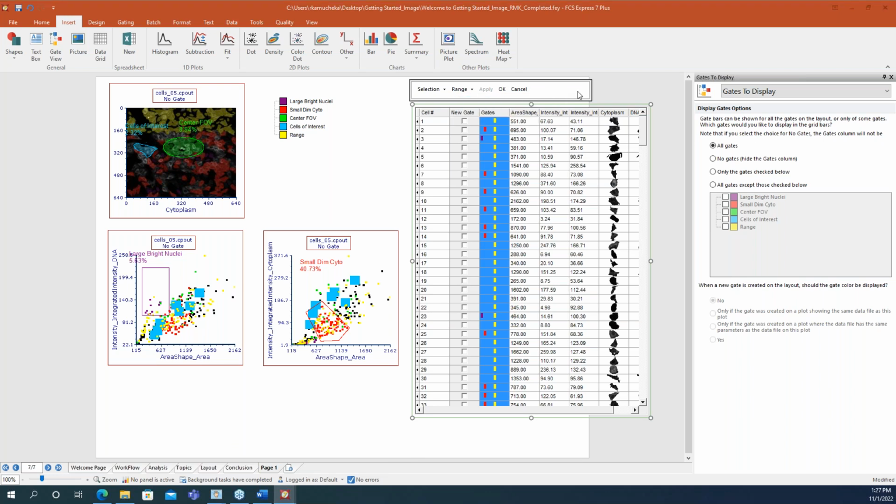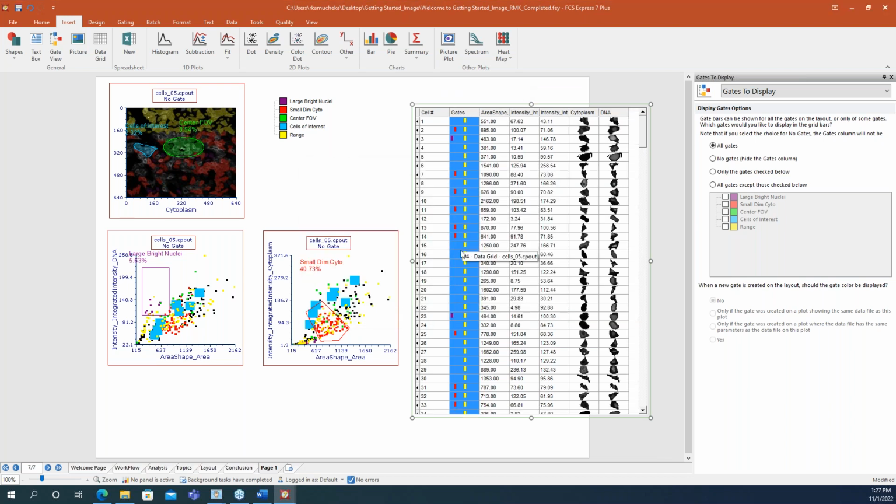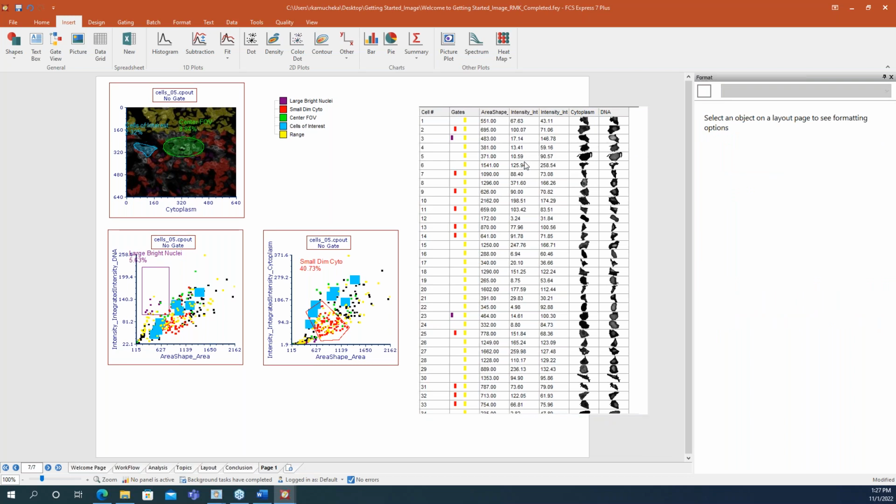Let me see if I can escape here. All right, there we go. And now we just have this work. We have our data grid here.